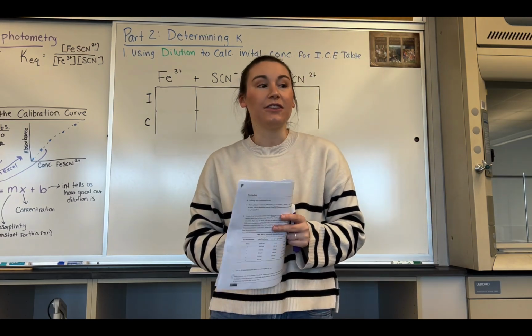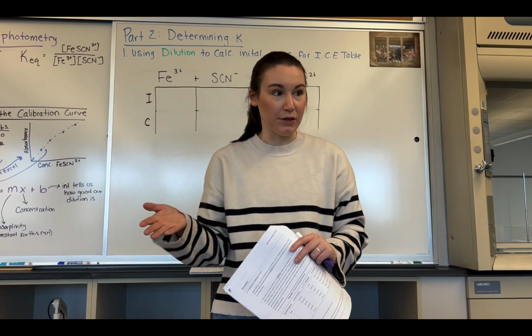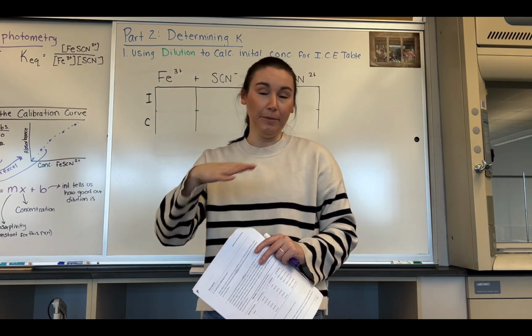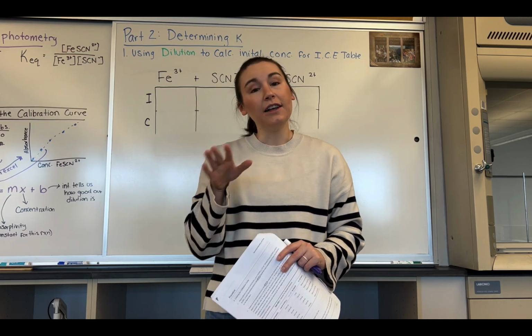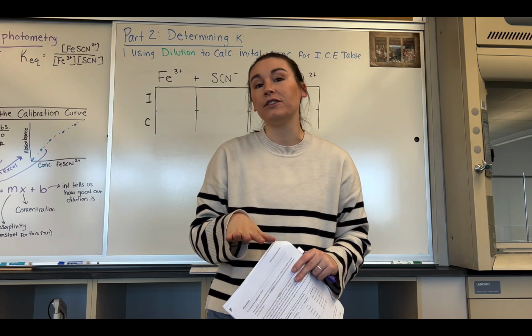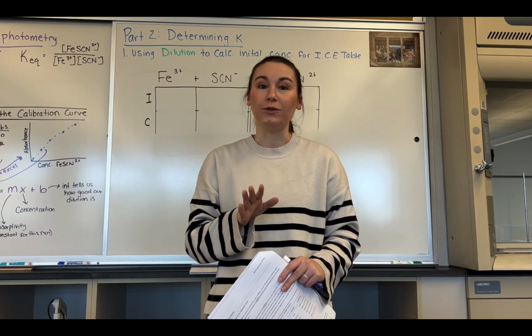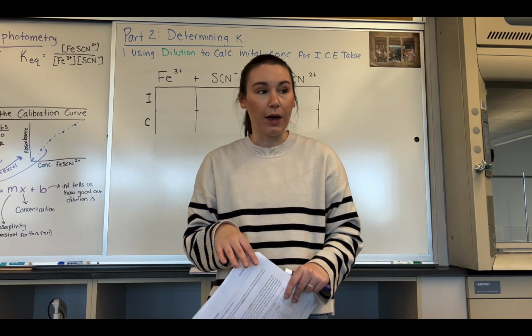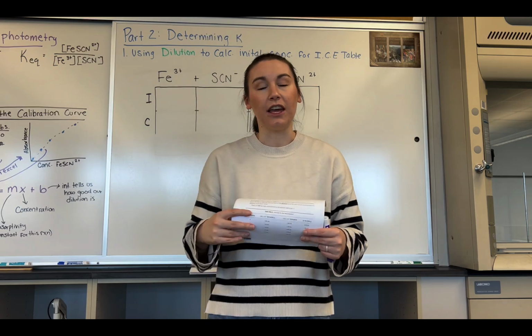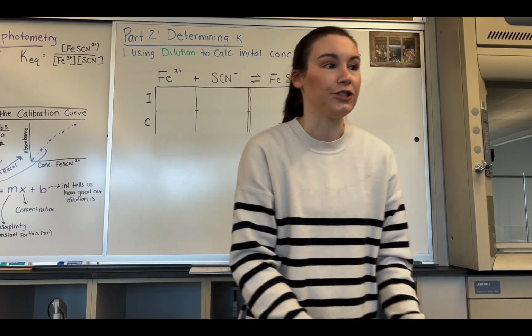You'll also see that the concentration of your sodium thiocyanate or your potassium thiocyanate, again, they can be interchangeable, as well as your iron nitrate, those concentrations have now changed. So you cannot use the same concentrations that you did in part 1 for part 2. So you need to make sure that you are using different concentrations. Okay, so for this portion, we're using this to calculate our dilution in order to calculate our concentrations.